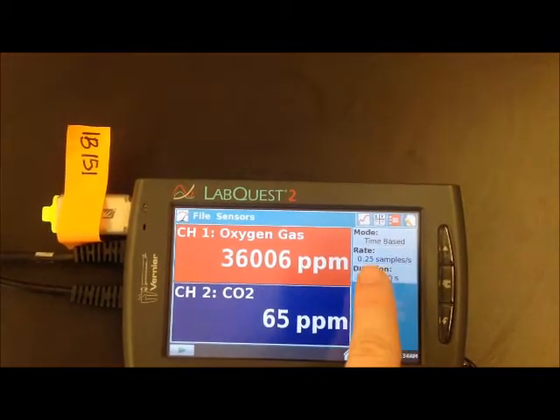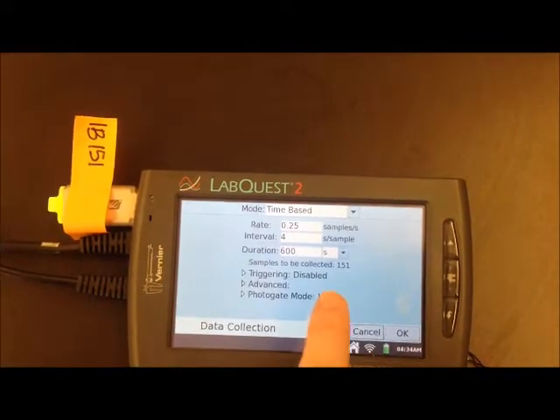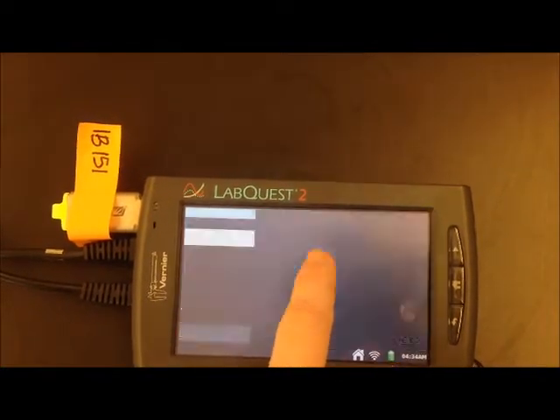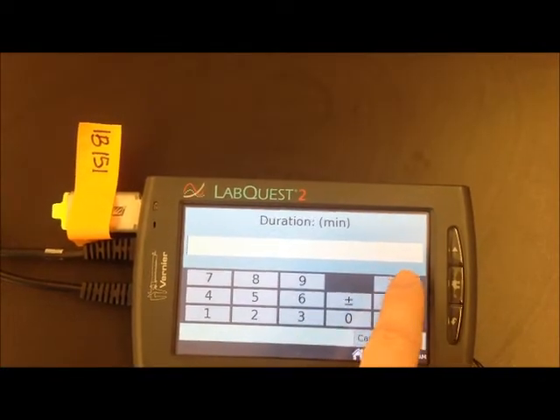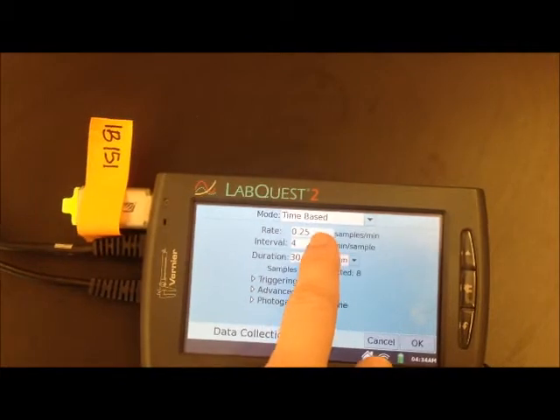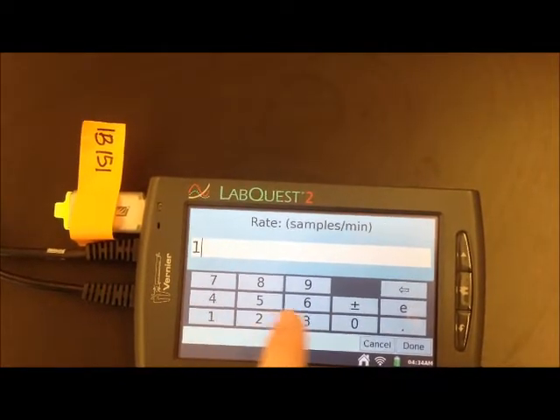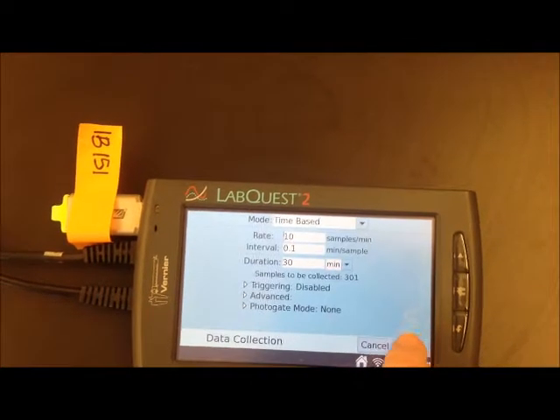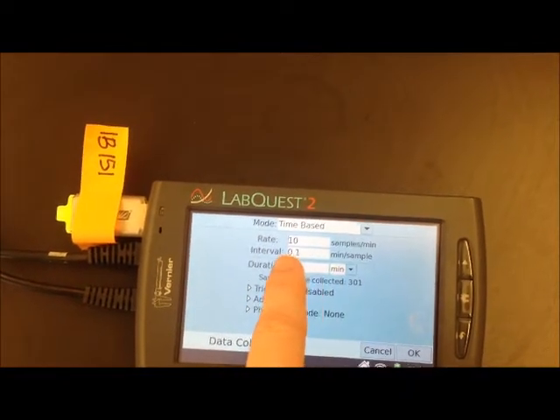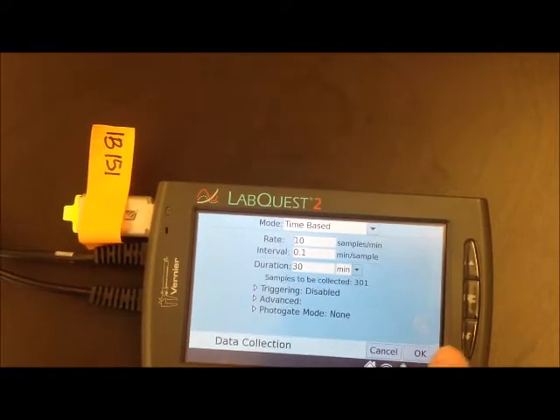We want to change the duration, rate, and mode. We want it set to 30 minutes, so change the unit to minutes and then enter 30. You should go ahead and calibrate these once you're ready. We want 10 samples per minute, so change this to 10 samples per minute. Now every sample is 0.1 minute in duration — that's how we change the data collection settings.